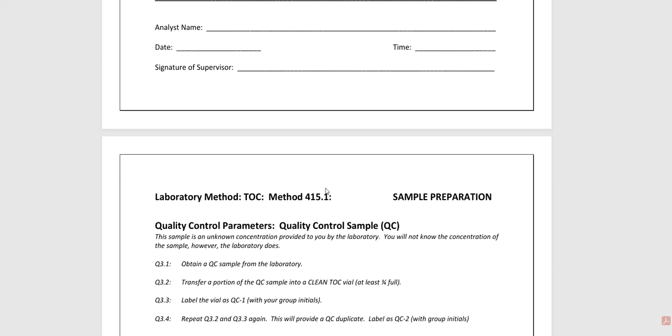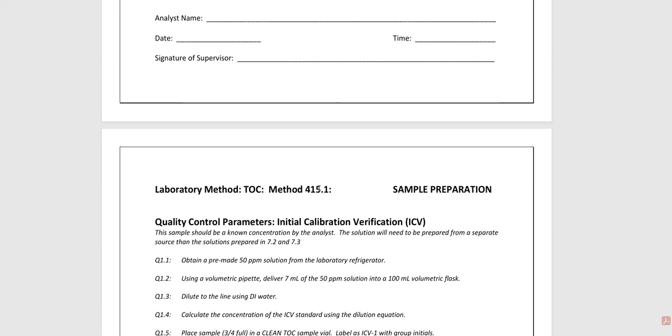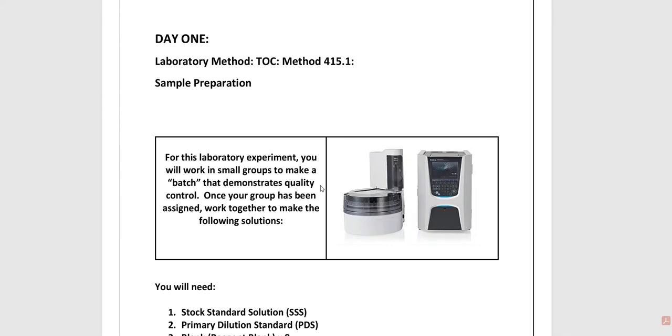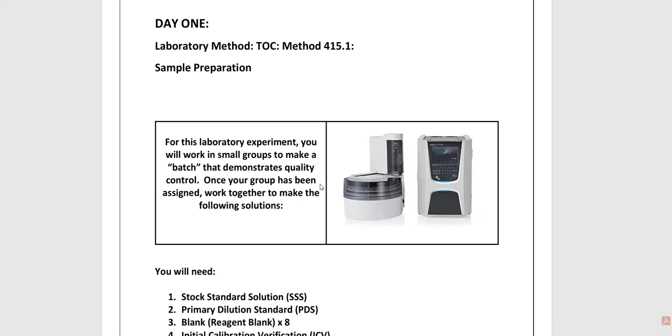Folks, this is a very lengthy 2-day event that we are going to accomplish in our lab, and it looks very deceiving because it looks like a lot, and actually it's not. It's a mixture of lab directions that we have to follow and areas that we can record our data in, and then there's going to be sections on a second day, and those second day sections are a place where I can do some of the calculations and see if this batch actually passes quality control standards. So that is the intention of this lab.